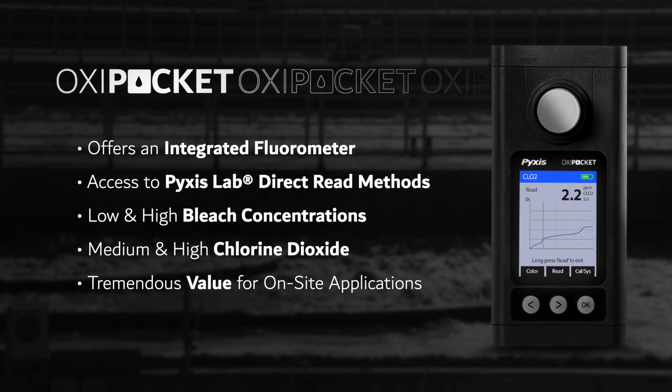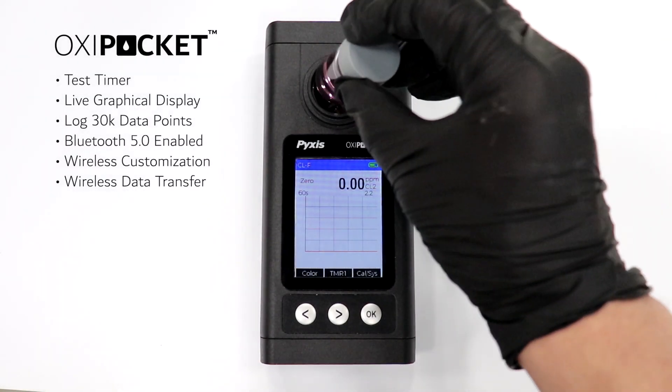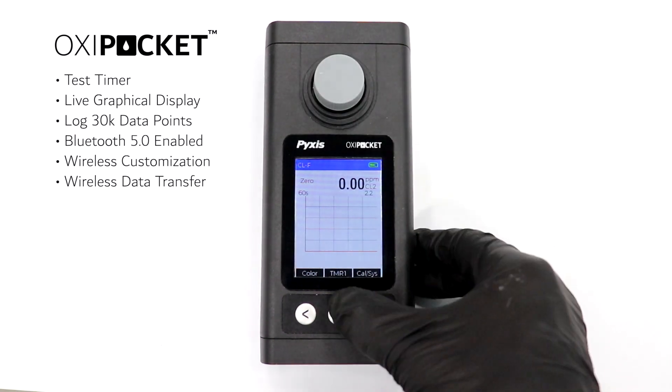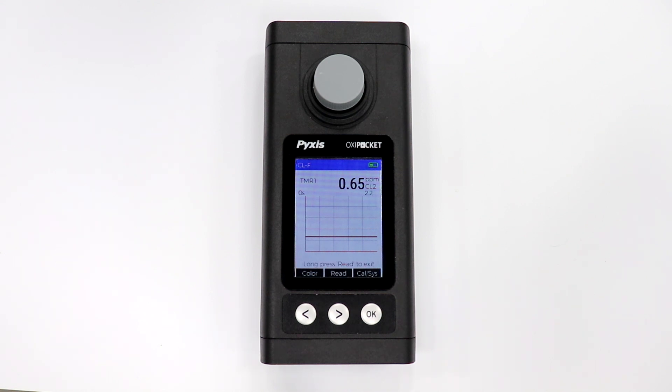These methods can provide tremendous value for on-site oxidizer generation applications. The Oxy Pocket offers a live graphical display of the residual as the test occurs to avoid wasted time in the field. It can also log up to 30,000 data points and is Bluetooth 5.0 enabled for wireless customization and data transfer via the uPixis mobile and desktop apps.